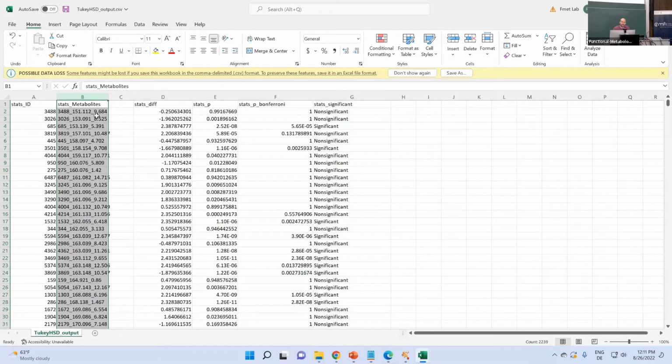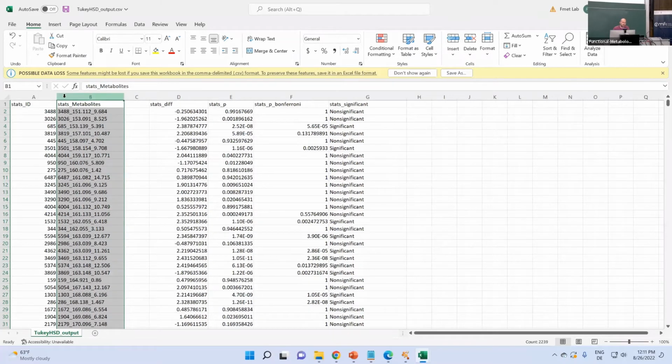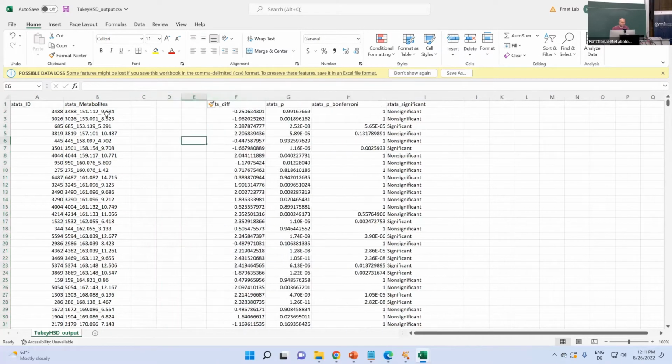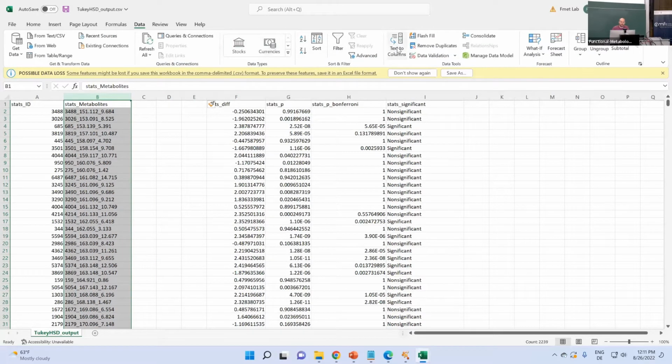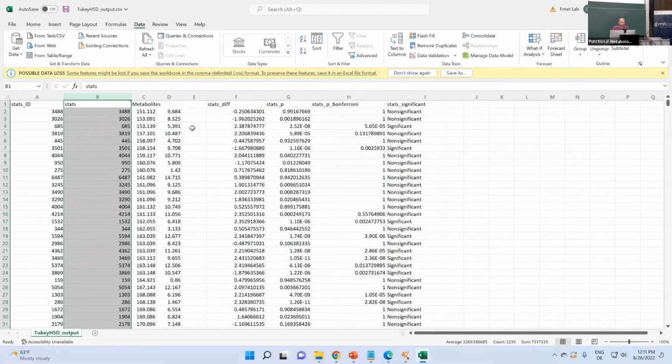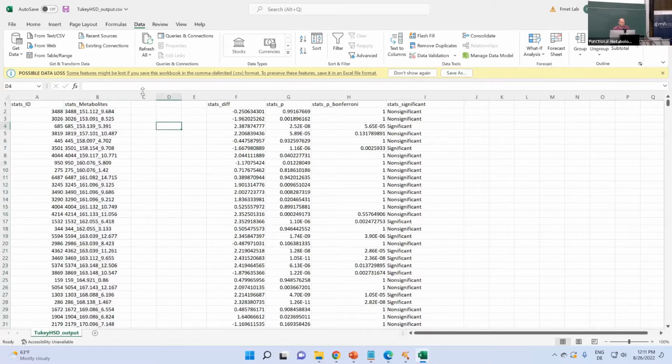So remember they concatenated the feature number, the mass, and the retention time in this longer string here. If there would not be a column like this, the same way as with Sirius, I could also split that other one. Yeah, can you quickly show again how to split that? Yeah. So I just click on it and then go to Data, then Text to Columns, and select underscore as a delimiter. And then it just splits it. That's very convenient with Excel.